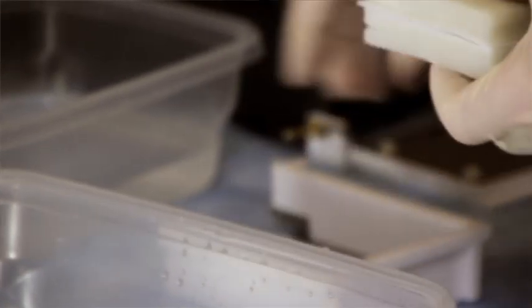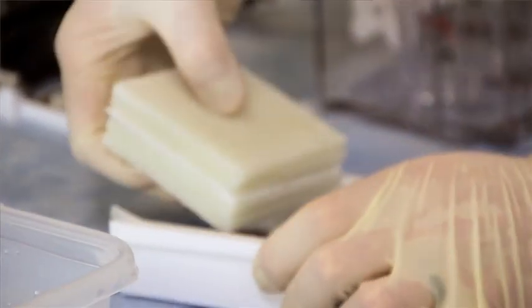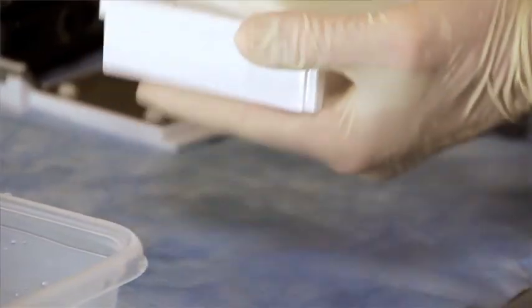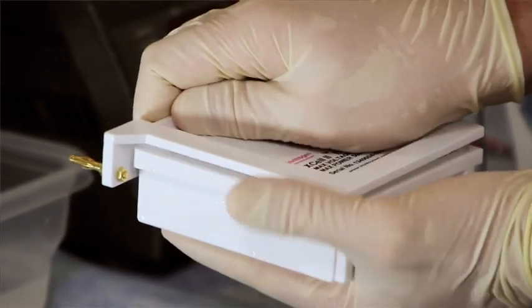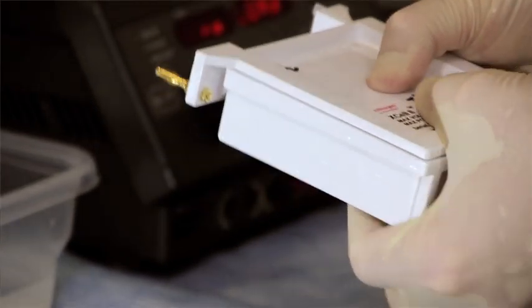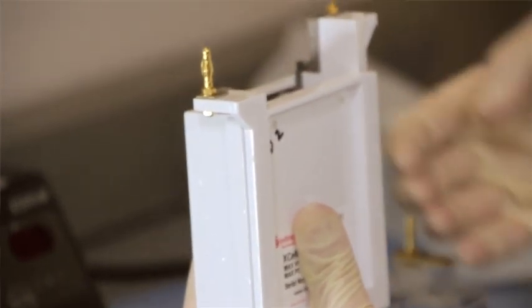And this whole stack goes into the blot module such that the membrane is on the positive electrode side and the gel is on the negative electrode side.